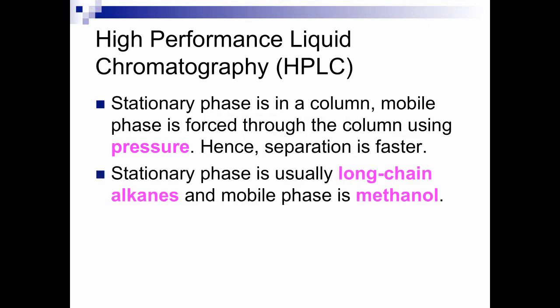The mobile phase is a high purity solvent while the stationary phase is contained in a HPLC column that consists of uniform porous silica particles with surface pores that are extremely small to increase surface area. The mobile phase is forced through the column using extremely high pressure, which results in better separation relative to liquid chromatography.